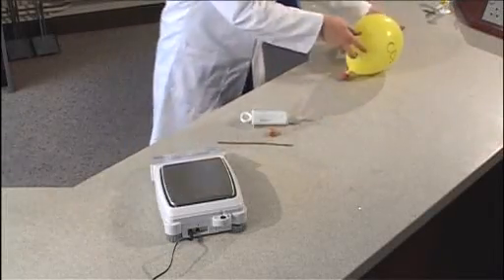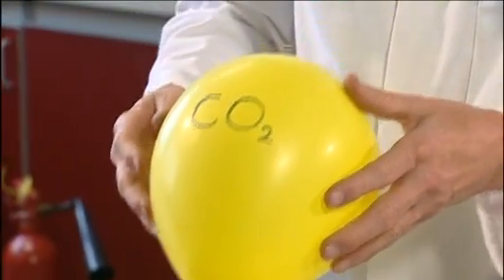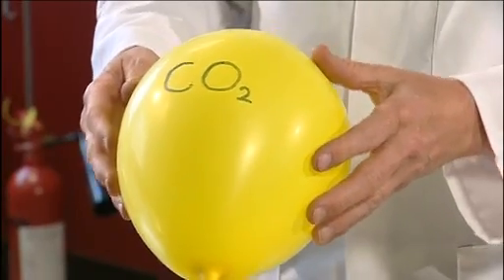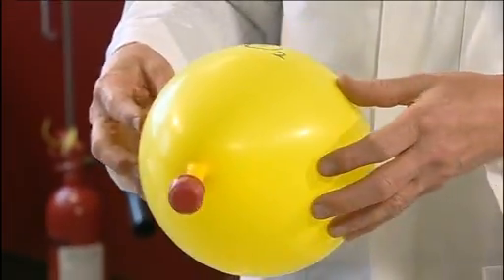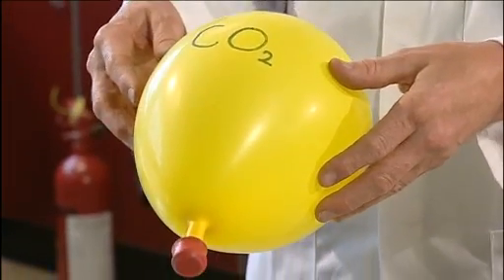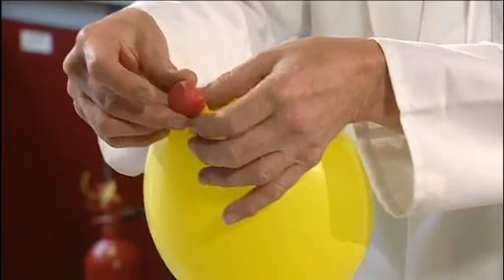You also need to prepare what we call a gas bag of whichever gas or gases you intend to use. This one is carbon dioxide. This is simply a party balloon which has been inflated with carbon dioxide from any convenient source and sealed with a self-sealing rubber stopper.